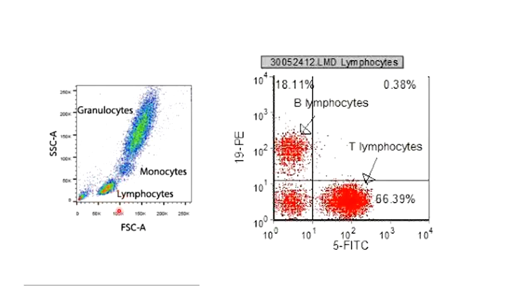Yes, within a 30 minute experiment, by utilizing flow cytometry, I can measure the percentage of lymphocytes in a person's blood. I can select here and the software will tell me the percentage of monocytes. If I select here, the software will tell me the percentage of granulocytes. Very easy, right? Within 30 minutes, we have the exact count and percentage of different types of cells like lymphocytes, monocytes, and granulocytes.